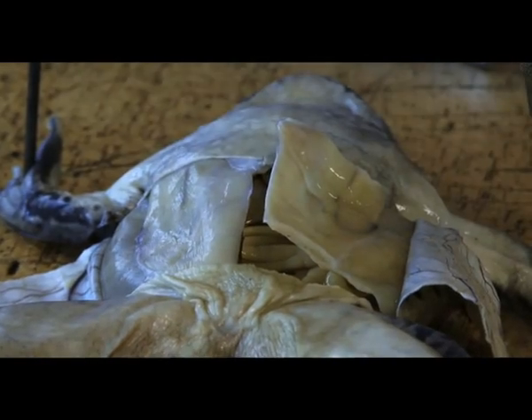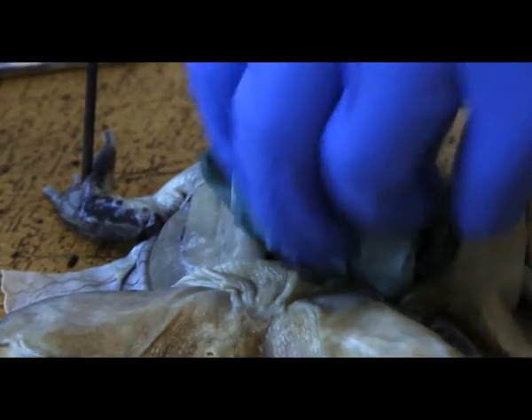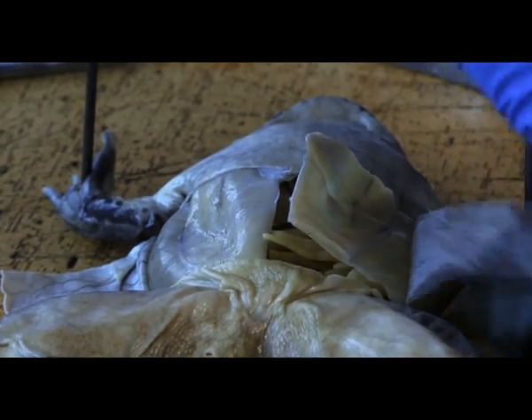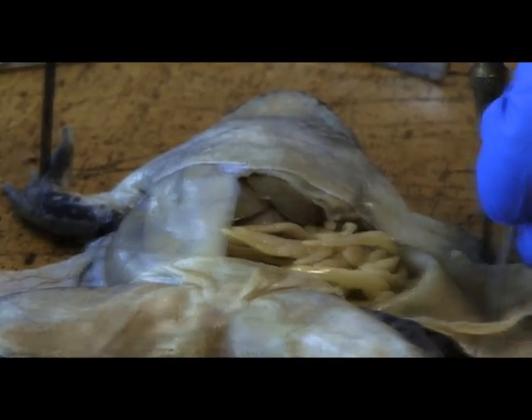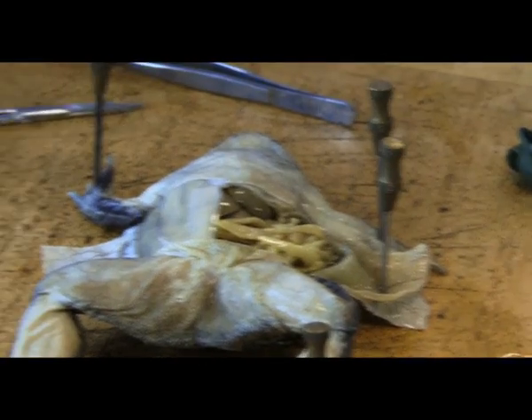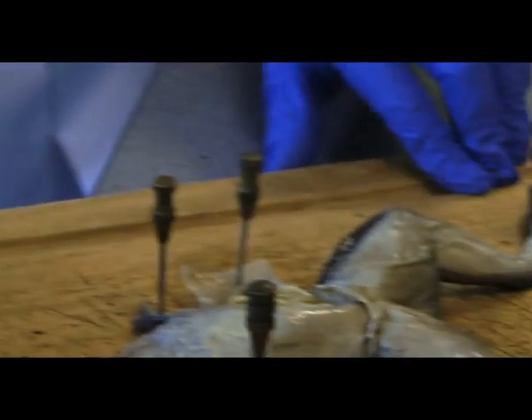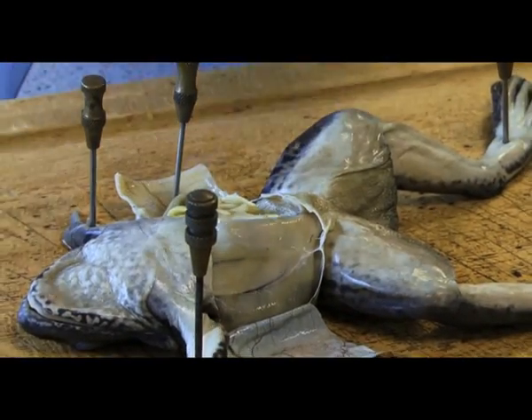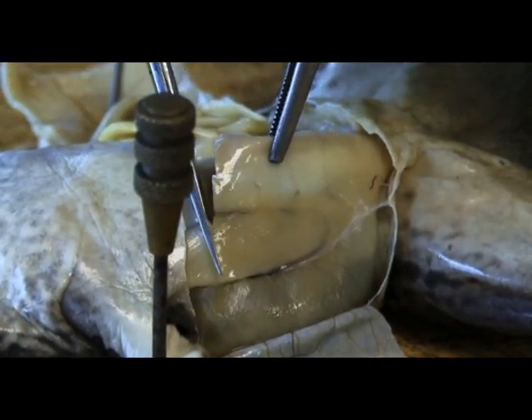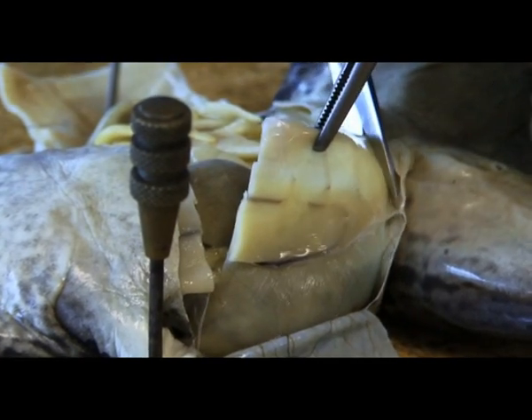Just absorb up any of this fluid that is on the inside here. And then we want to make the exact same incision on the other side so we have exposed the first lot of systems that are on the inside.